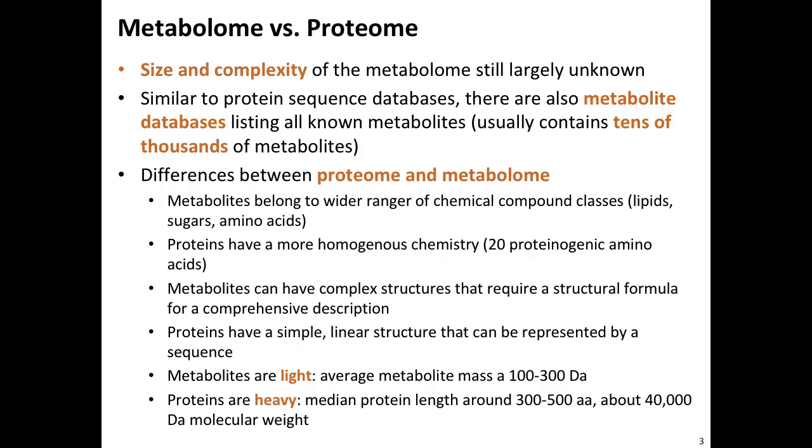Then there's a key difference, and that is just the weight. Metabolites tend to be small molecules. They tend to be lighter than peptides, usually 100 to 300 Dalton. I mean, I'm not excluding anything heavier here. Again, that's a very fuzzy boundary, but on average, they tend to be lighter than the peptides we see in shotgun proteomics.